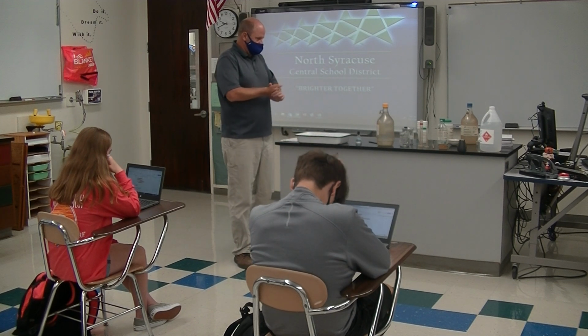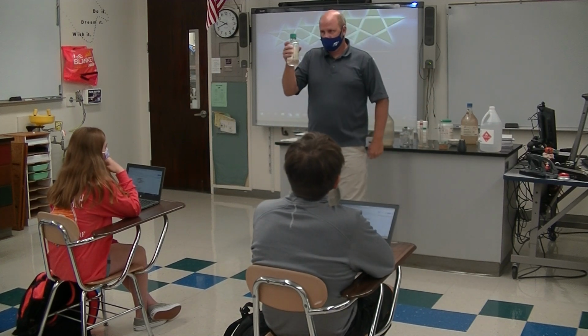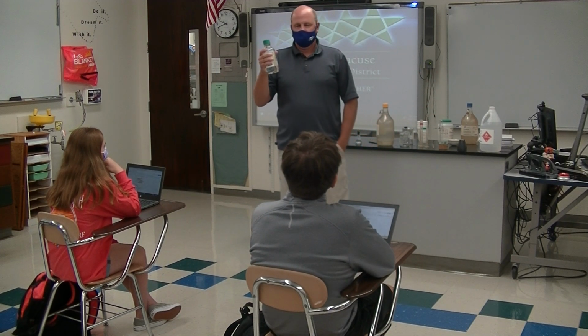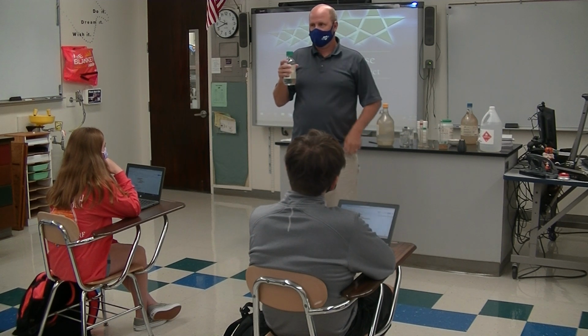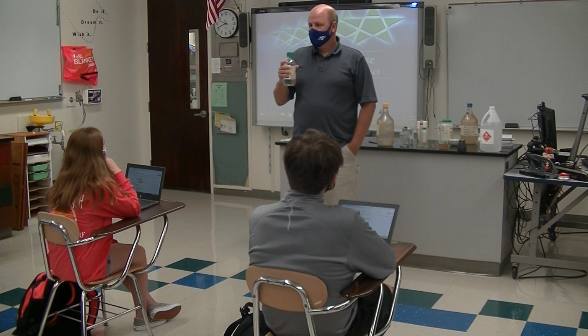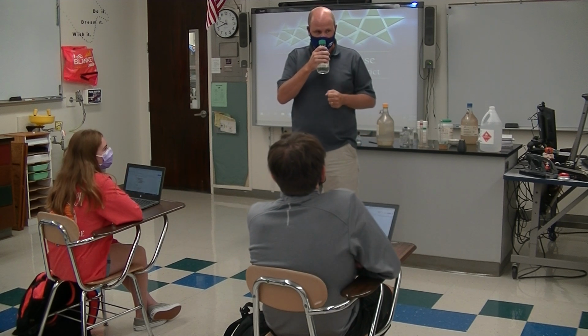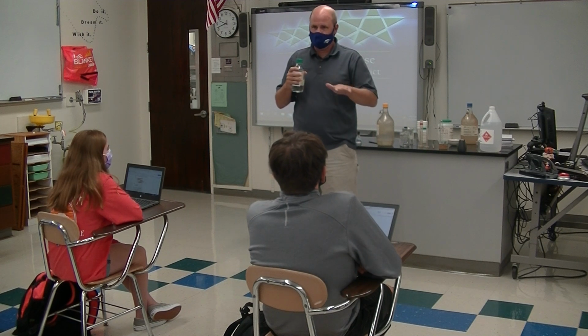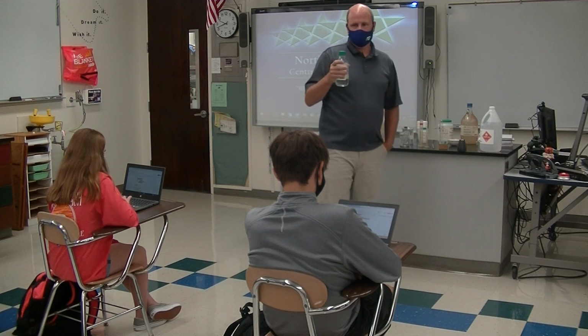Okay, odors. We're going to have somebody identify this odor. Do you guys know how to smell things properly? Because I don't want you to come over here and stick your nose right over this, because that's not good. So how do we smell things properly?